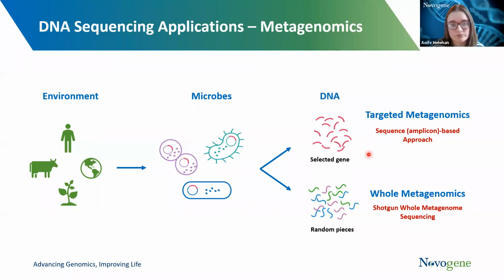Next up is a question from Bonnie, asking, can we use whole genome amplification methods to increase amounts of DNA for sequencing? And if so, do you have any method recommendation for this?